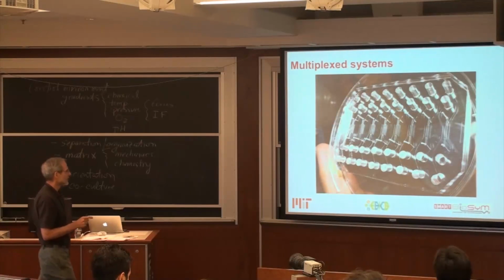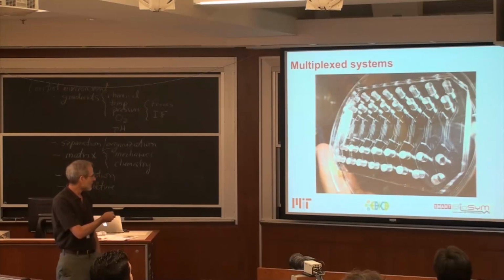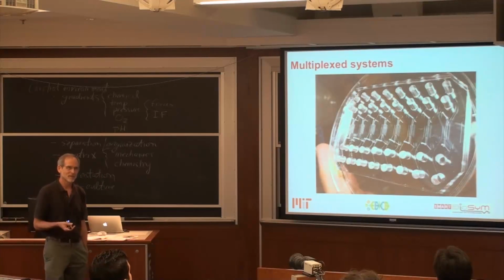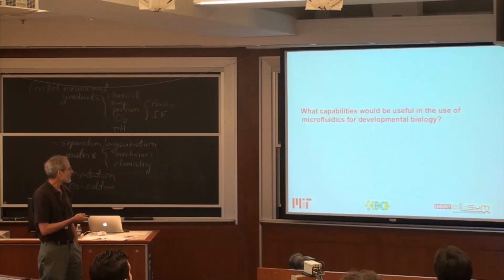And I mentioned that you can start to do this in high throughput. Your devices just have a single experimental region that looks something like this. We're now developing systems where we can multiplex it and do more experiments in a shorter period of time.